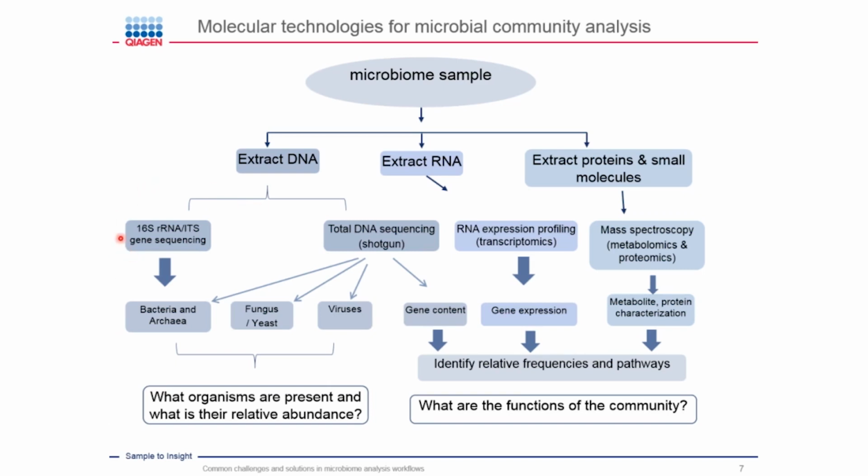This information is often analyzed by using the 16S rRNA gene from bacteria. This gene is inherited in all bacterial strains in different copy numbers. So you can have between 1 and more than 10 16S copies per genome, depending on your bacterial strain.